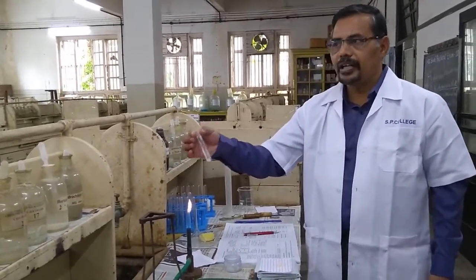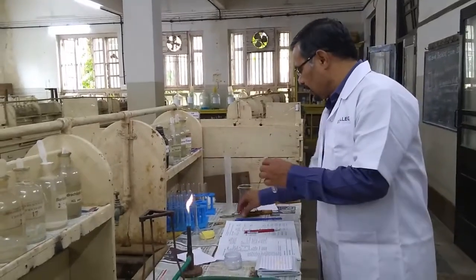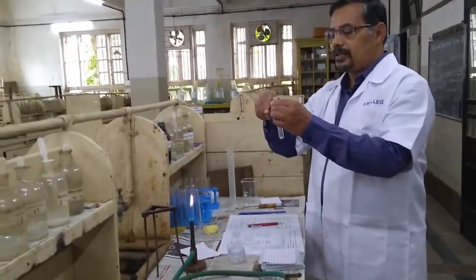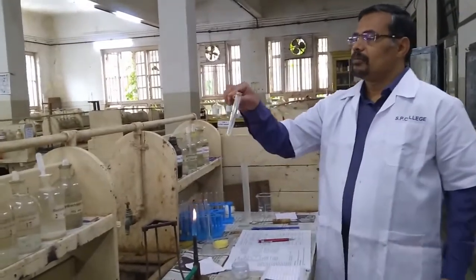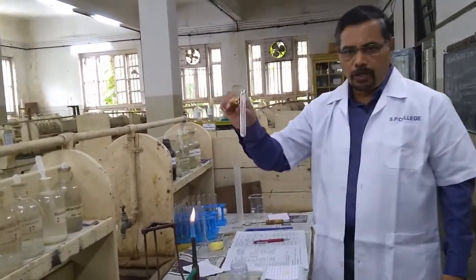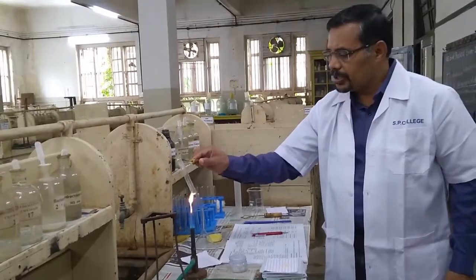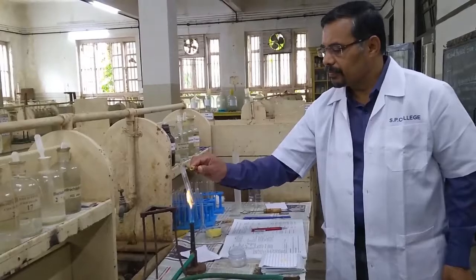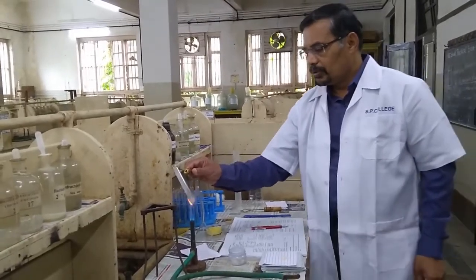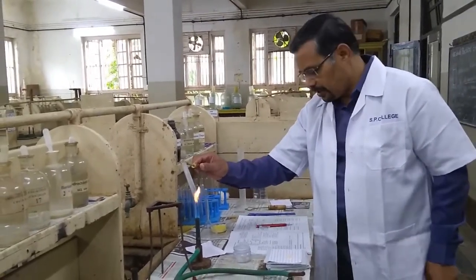So during this heating, we will observe different observations. So we can hold this test tube with the help of this test tube holder. So if we heat this mixture slowly using this burner, then we will observe different observations.